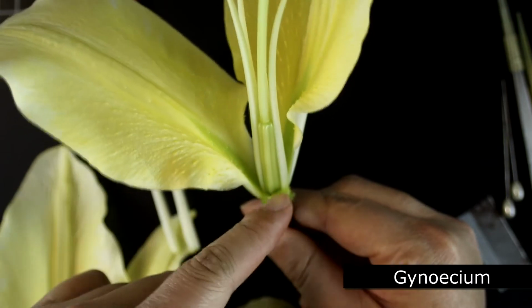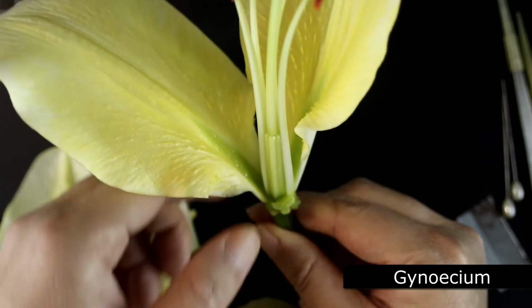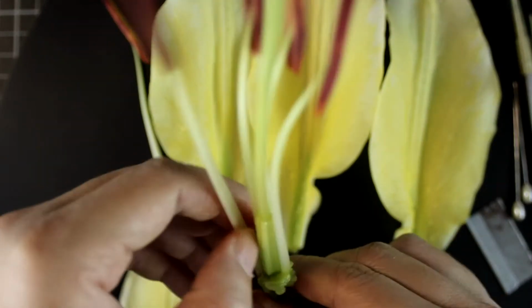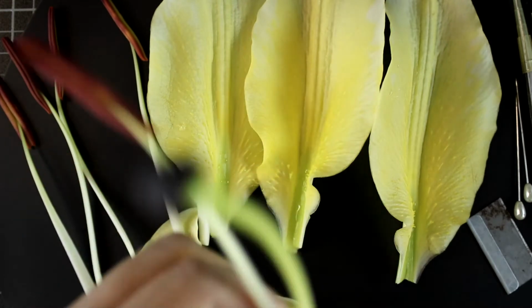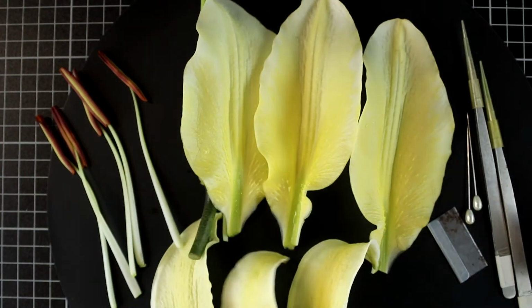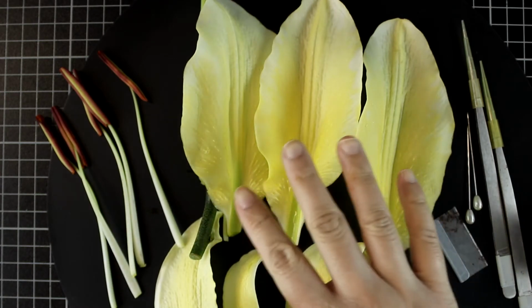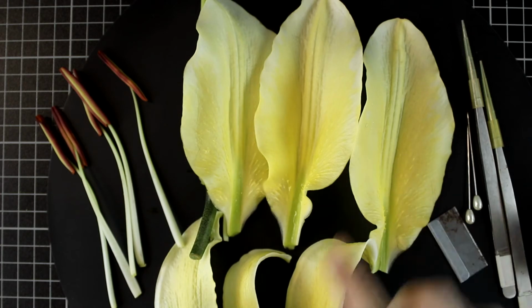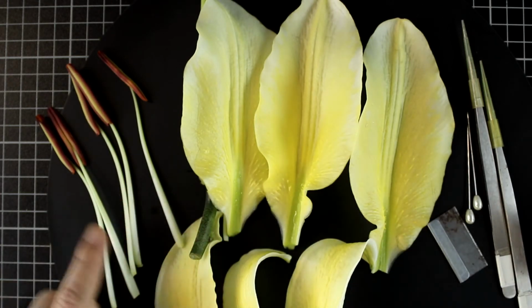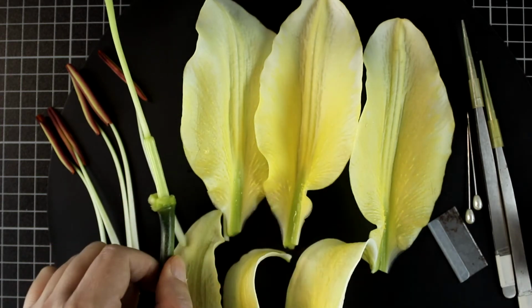Okay, now I can find the pistil, the female part, gynoecium. As shown here, there are 6 tepals altogether. They form 2 whorls, and there are 6 stamens, and each of them is aligned with 1 tepal, and there is 1 pistil.